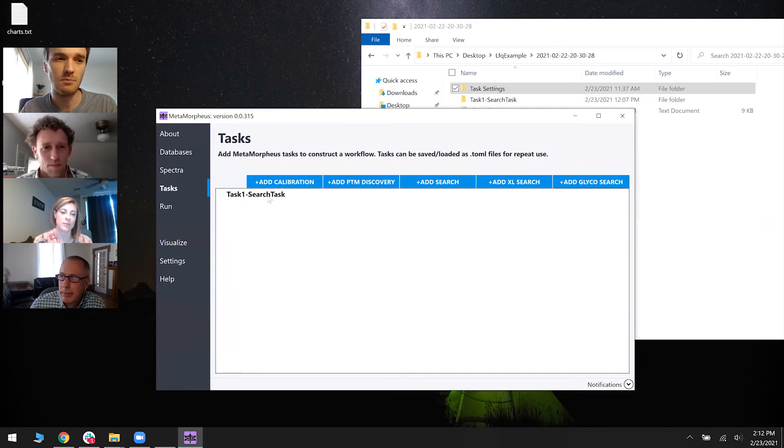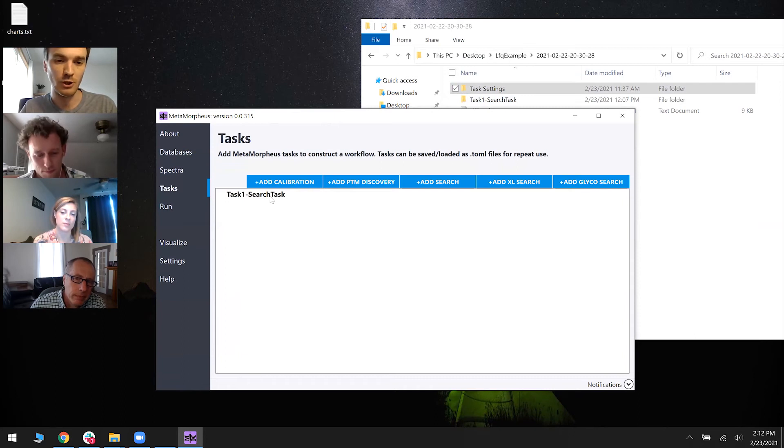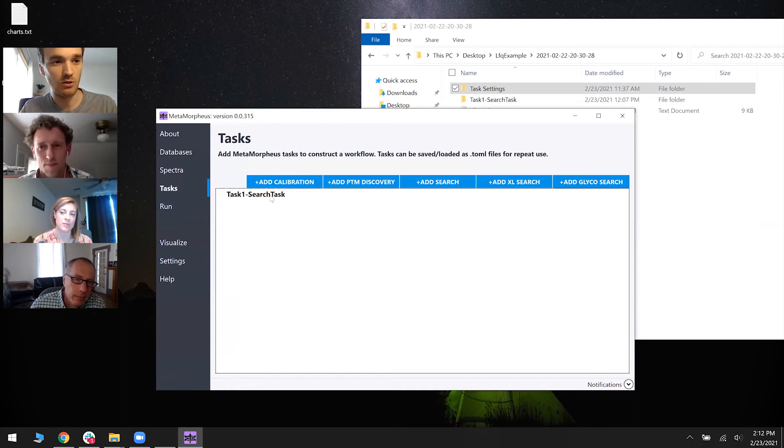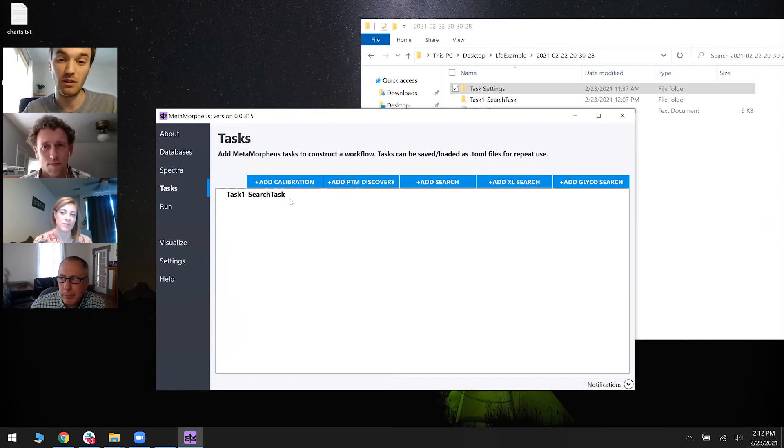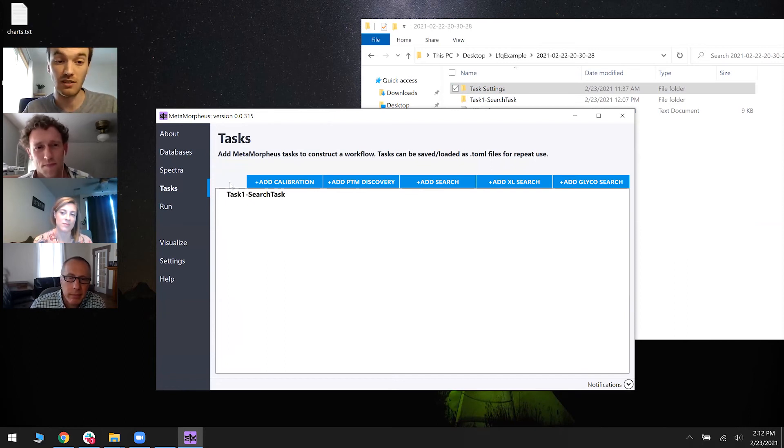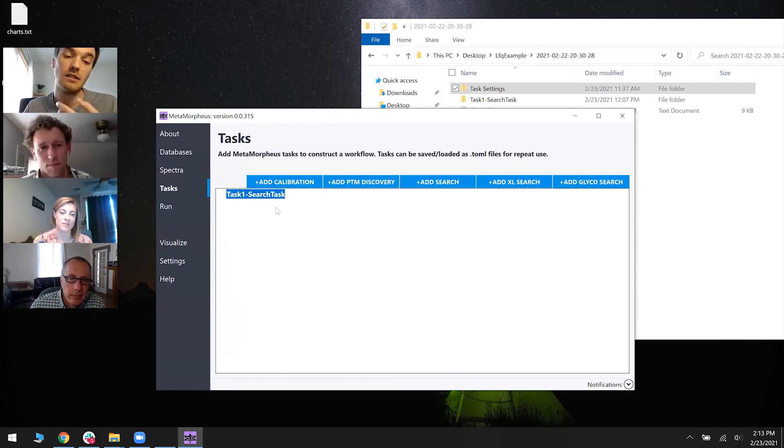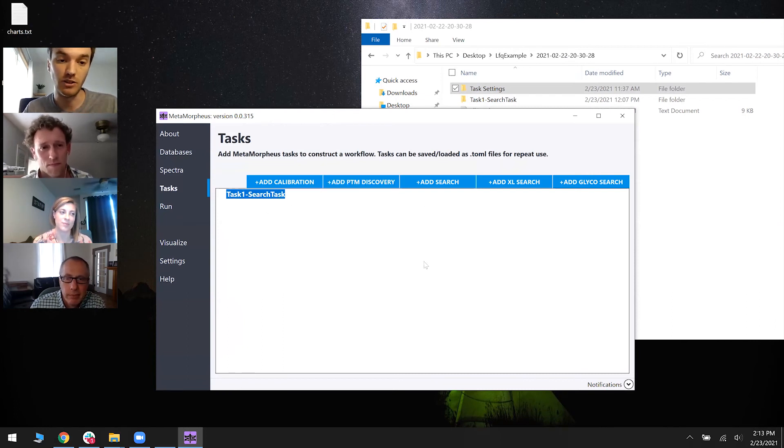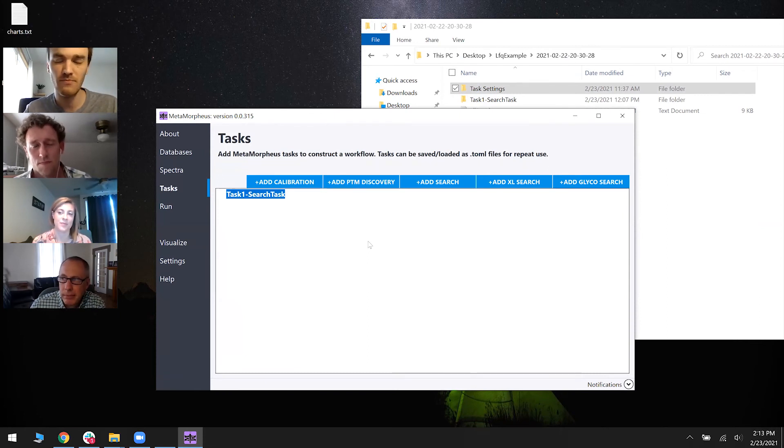So typically, there's also a command line version of MetaMorpheus. I'll show you in a second. You can create TOMLs with the command line. But personally, I would recommend if you have a Windows machine, I would recommend that you create the TOML via GUI and then save as, and then use that TOML in the command line.